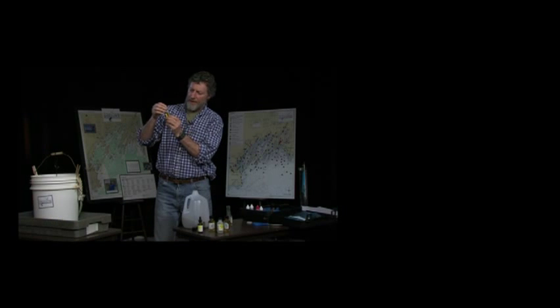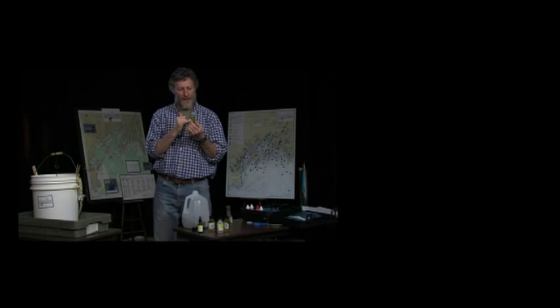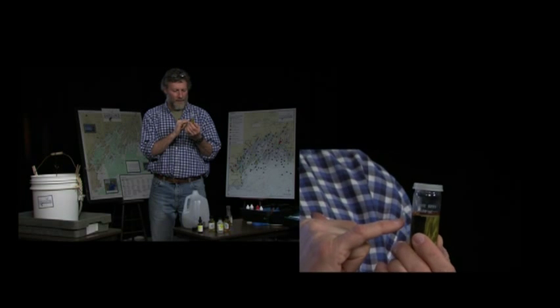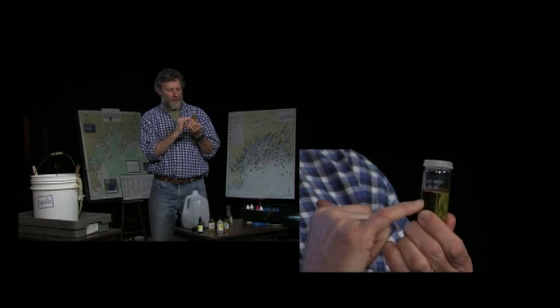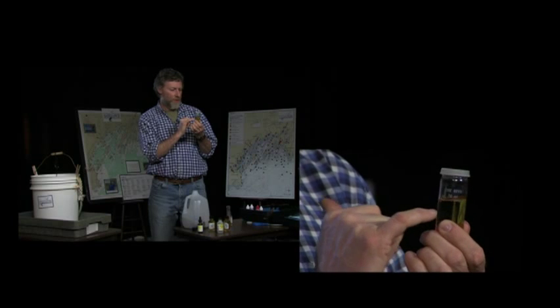One thing to keep an eye on: the glass jars that come with the kit have a little white line on them that says 20 mils. If you look at it, the water level is not actually on the 20 mil line. It's a little bit above the 20 mil line that's written on here.